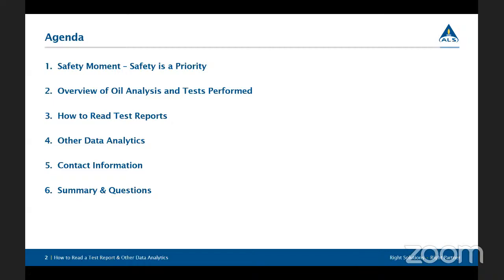It's great to know how to read a test report and understand what that data means on a sample-per-sample basis. But when you can combine all that data together and see what is going on across an entire program, that can bring a lot of extra value and can sometimes hint towards things that you might not see on an individual report basis. Then I'll give you my contact information, and then we'll get into a summary and questions at the end.